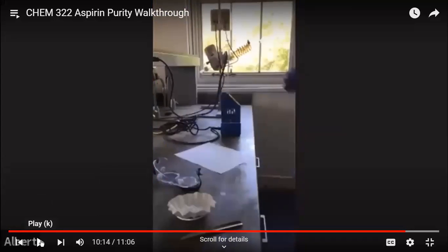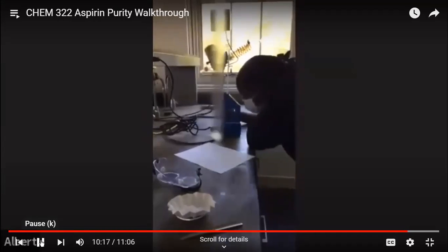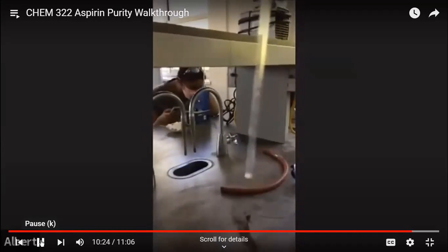But again, once you get about 20 degrees outside of the melting temperature, you can really focus in. You don't have to sit there and just watch it the whole time. But undoubtedly, every semester, somebody will look away or start holding a conversation, look back, and everything is melted. So you have to pay attention to detail with a process like this. So you can see right here, that was a solid, and now it's kind of, let me see. And now it's fully liquefied, so that's what you're looking for through that viewfinder.